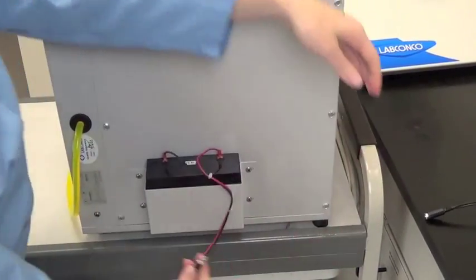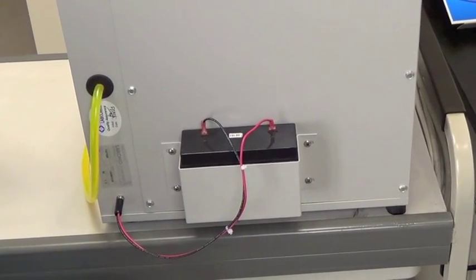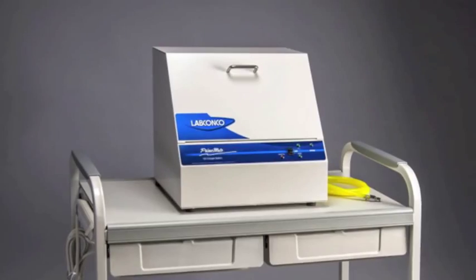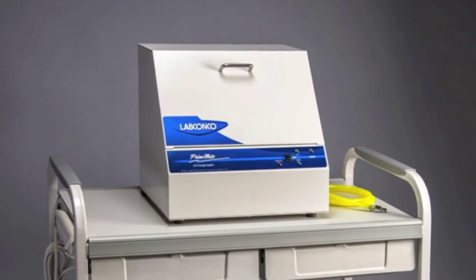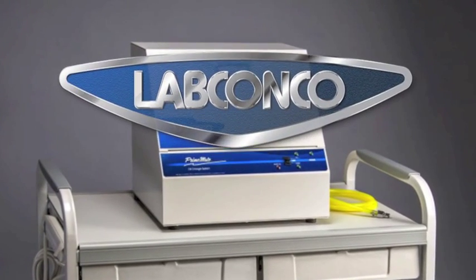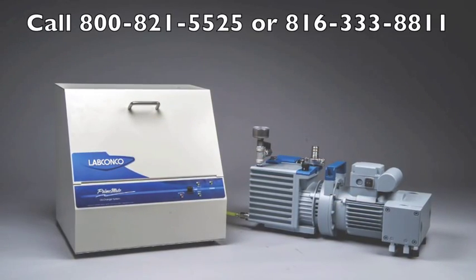Remove the plug on the battery harness from the charger and insert the plug into the receptacle on the rear of the Primemate. A single charge will last up to eight hours of service. Oil changes are fast and mess free using the Primemate. For questions, please contact Lab Conco at 800-821-5525.